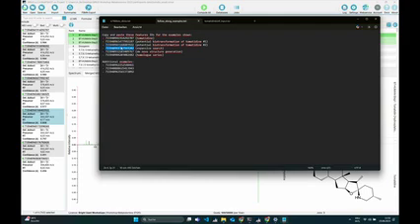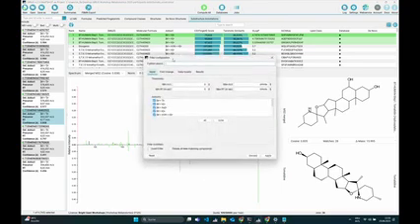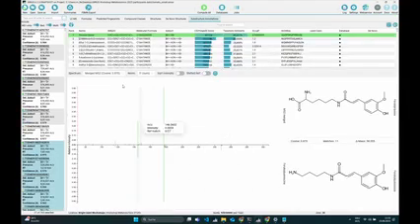Now let's look at another example where we will leave our custom database hits. Maybe this is one thing that is important to know. We have now filtered our feature list, and if you want to discard the filter, you simply click on this ... next to the search bar. This will open the filter panel again, and you can click in the bottom left on reset, and this will reset all your filters. Don't forget to click on apply, and you will then get your original list of all the features.